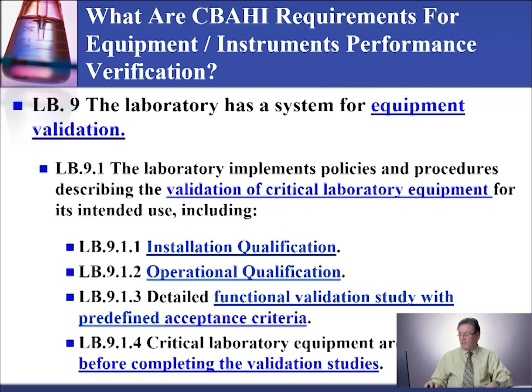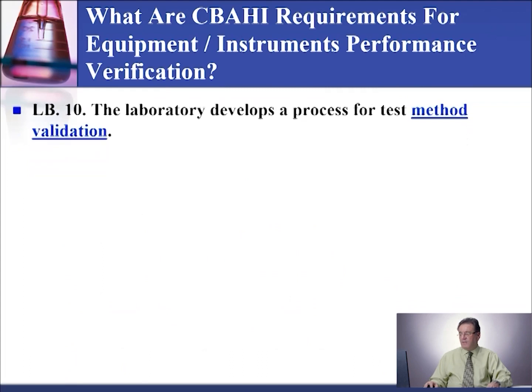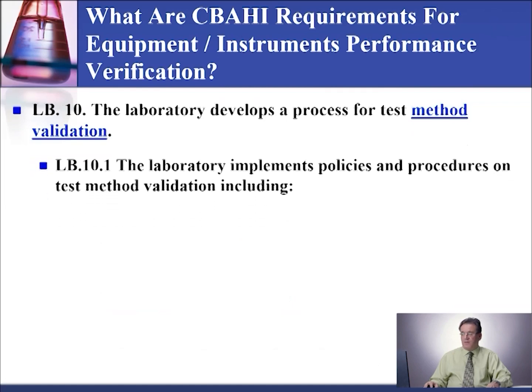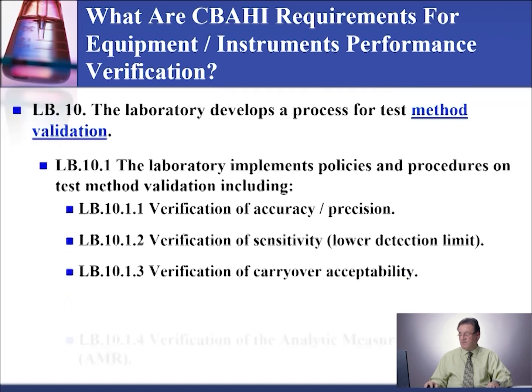Also, you need to check the instrument function checks or tests: all calibrations, cleaning, maintenance, and related tests and results should be verified to be acceptable. Also, check for secure data storage, backup, and archiving. As applicable, test secure data handling such as storage, backup, audit trails, and archiving at the user site according to the written procedure. When we say user site, that's your site, your laboratory.